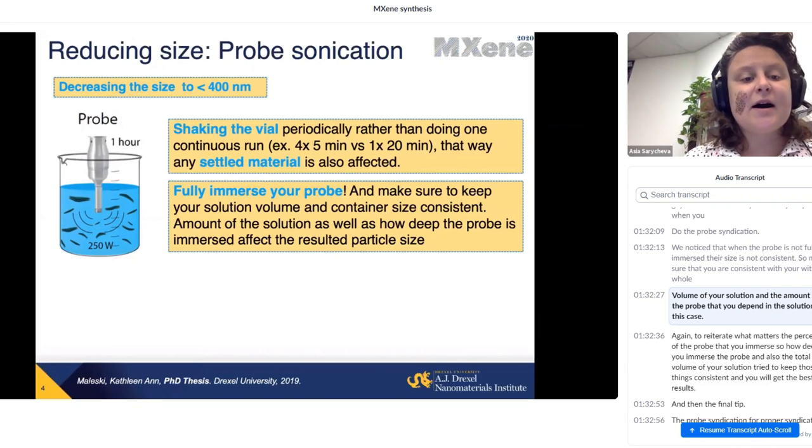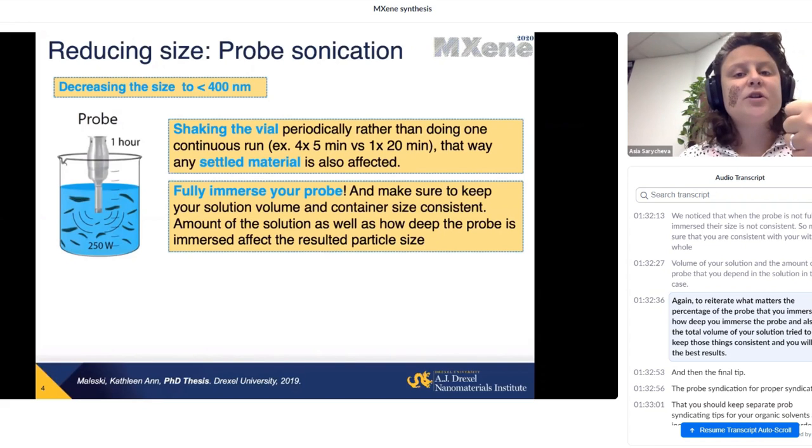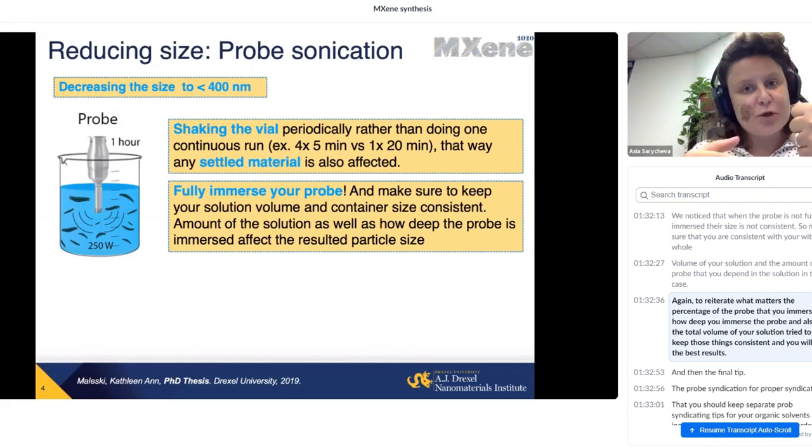In this case, again, to reiterate, what matters is the percentage of the probe that you immerse, so how deep you immerse the probe, and also the total volume of your solution. Try to keep those things consistent and you will get the best results.